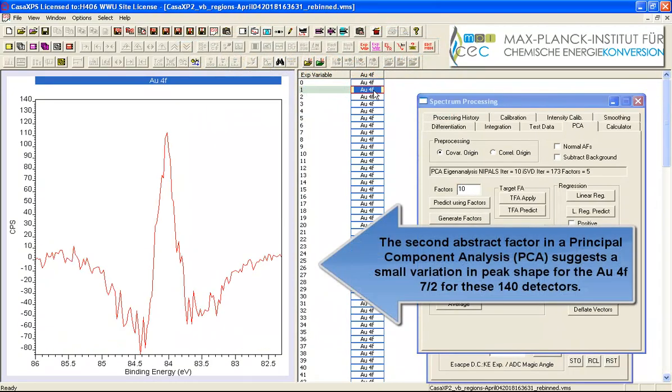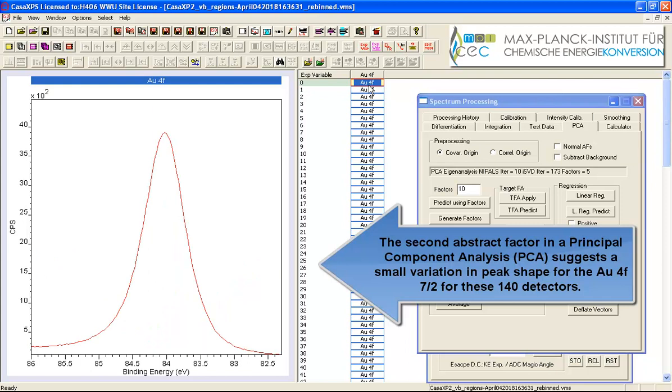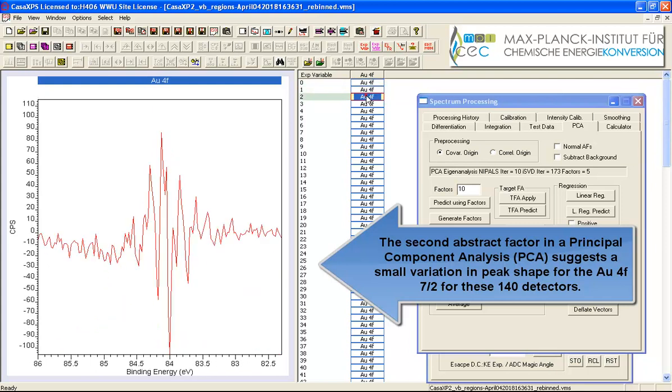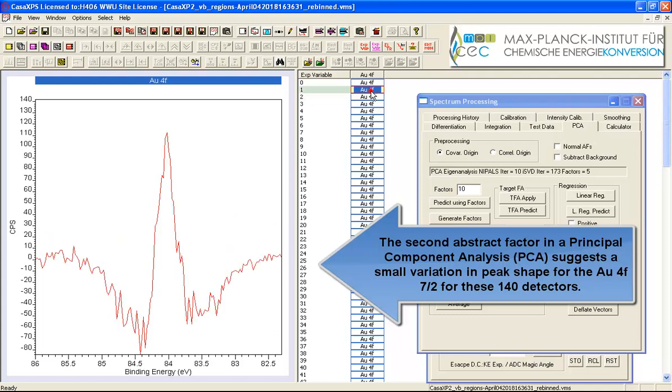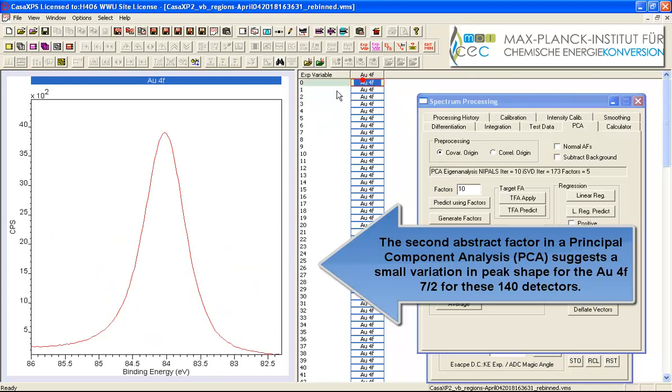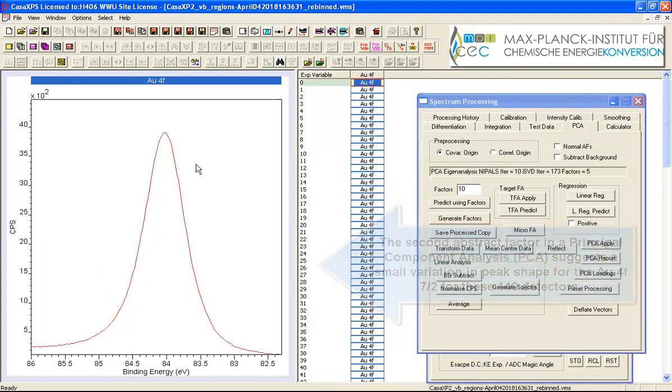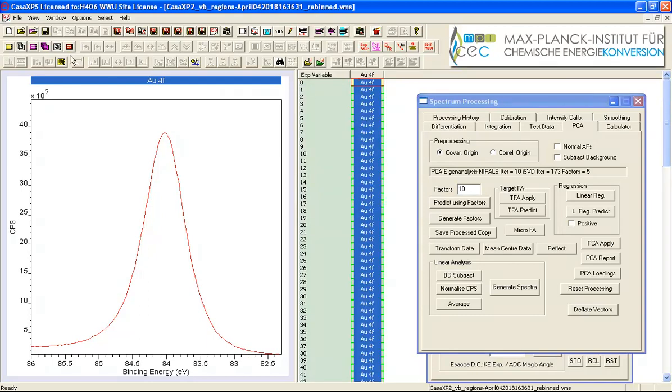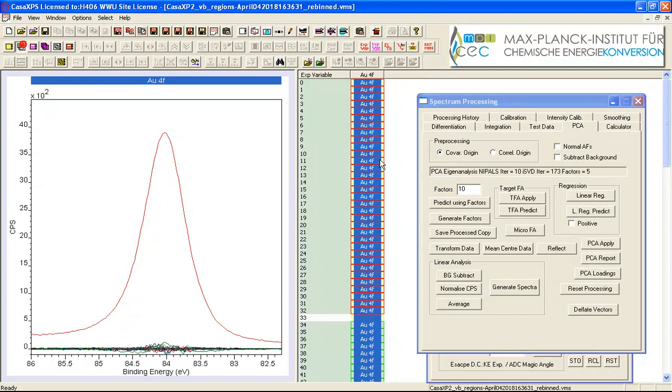If I generate principal components you can see that the spectra are transformed and the third one is looking more like noise but the second one has a little bit of structure. So even all these operations that I've performed would yield a peak that had some variation as a consequence of adding these different detected channels. Let's have a closer look at this again.